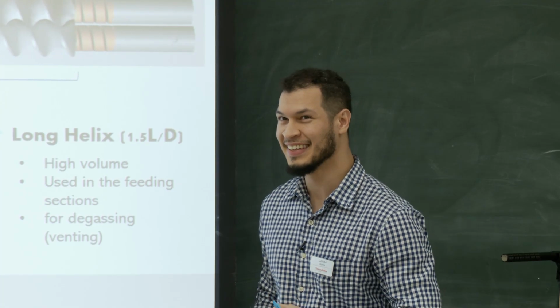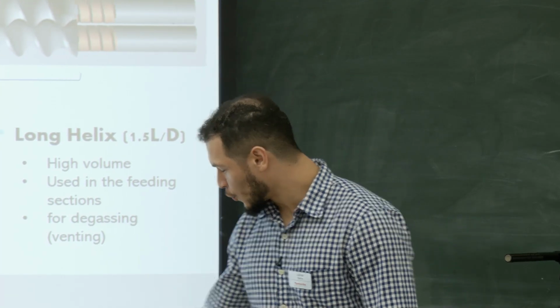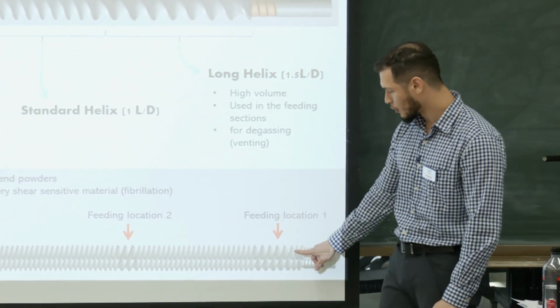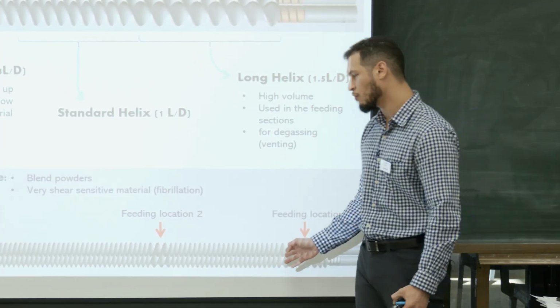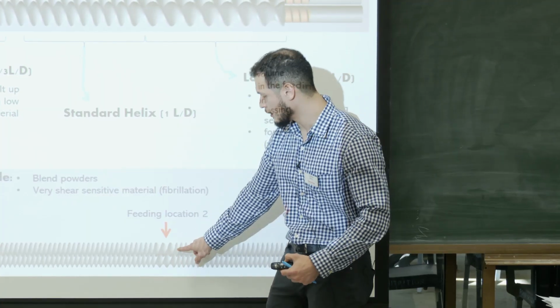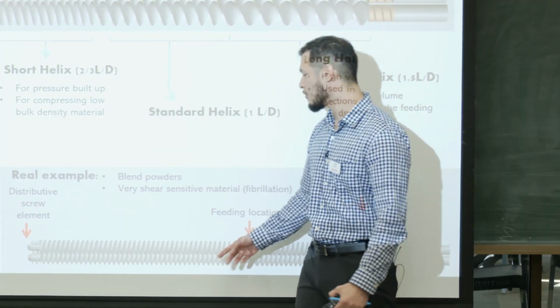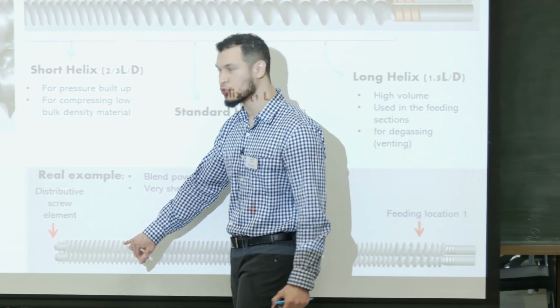Interesting. Yeah. Question, like, okay, because I have the same issue. So we have here long helix. We fed two powders here with long helix, so we can intake this material, and then we convey these materials, and then we feed the third material in here. I added more long helix conveying elements here too, and then we have basically everything conveying elements. And then I use the twin screw granulation.